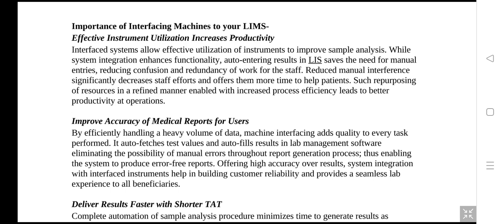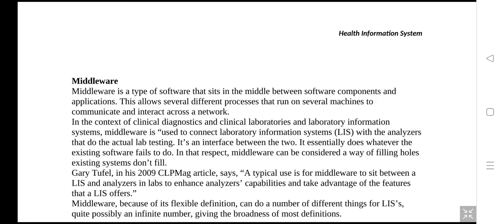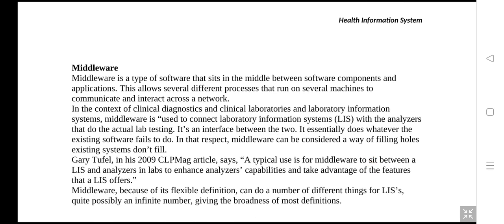The importance of interfacing machines with your LIMS is, first, effective instrument utilization and increased productivity. We also have improved accuracy of medical reports, with shorter turnaround times and so on. Among others, these are some of the advantages of why we should integrate our LIS with some kind of interface.